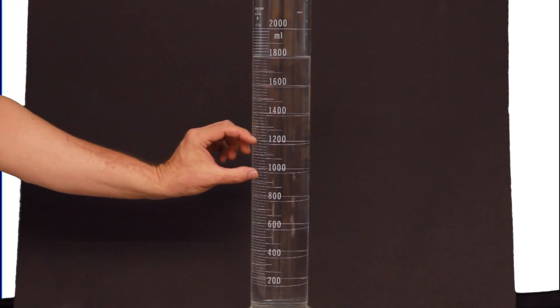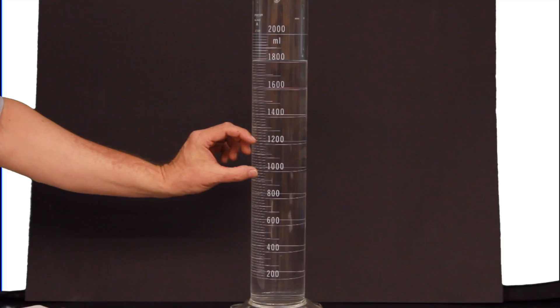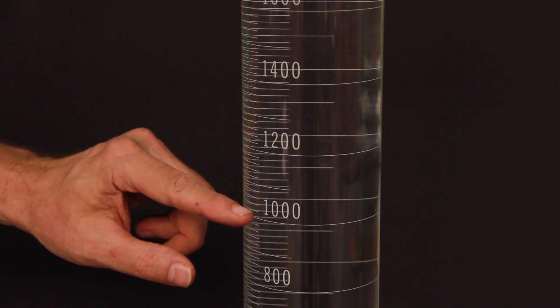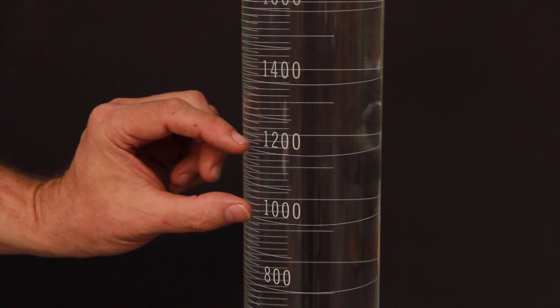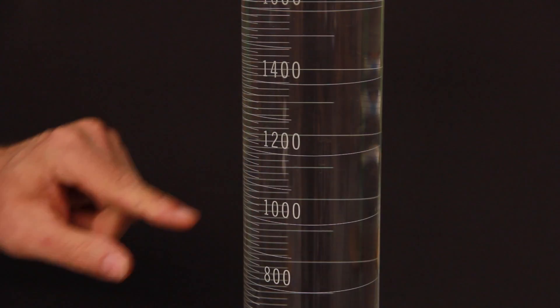In this example, the difference between the two adjacent numbers is 200. Starting at the bottom number, it takes 10 lines to get to the top number. Dividing 200 by 10 gives you an answer of 20 milliliters, which is what each line represents on this cylinder.